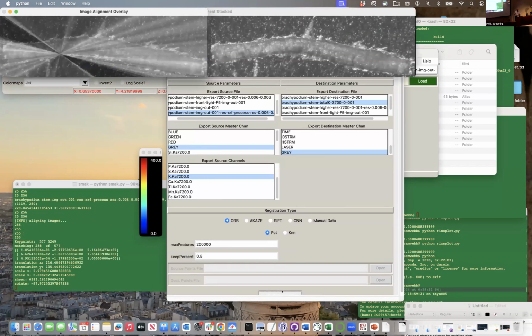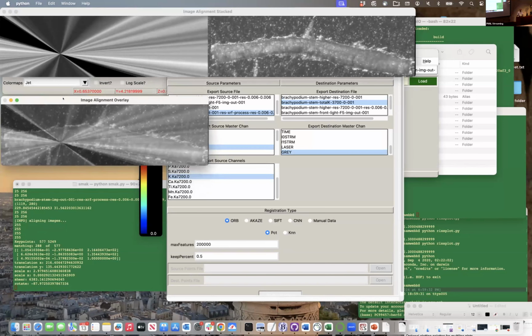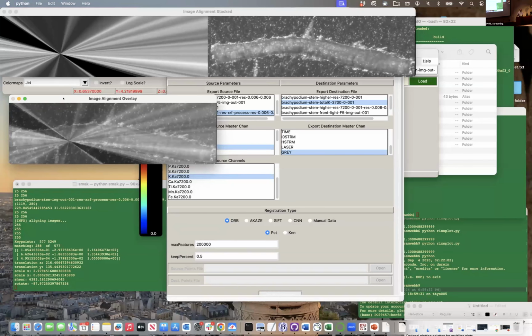And there's your space warp. And so here it is, it's merged it together. And you can definitely see that those two images do not overlay well because they are very different. And there's your transform. That did not work well at all.